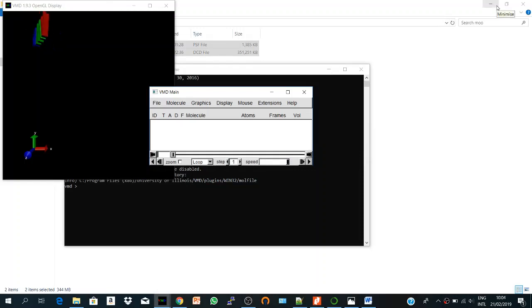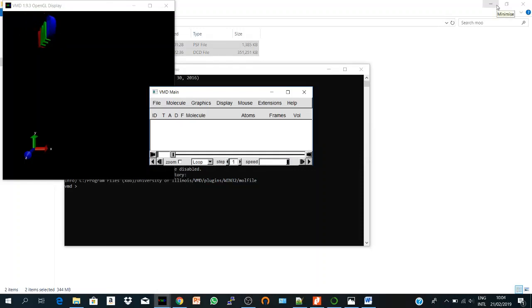Hi everyone, in this video together we will learn how to create shorter trajectories using VMD.